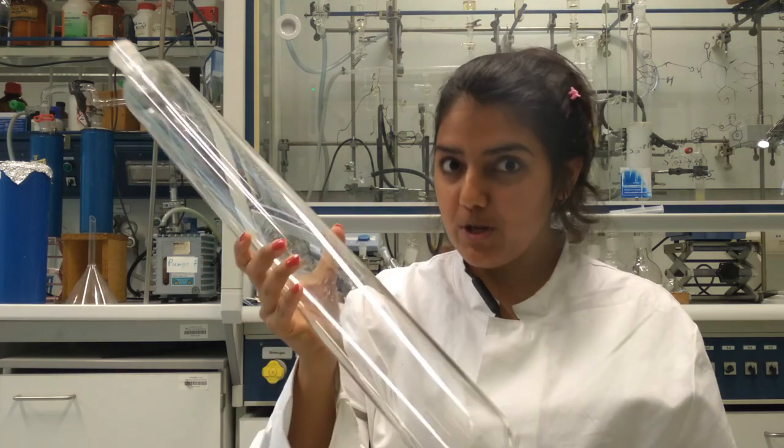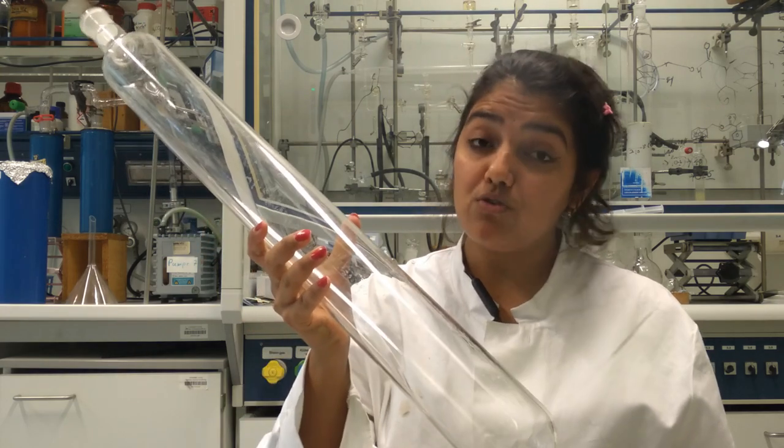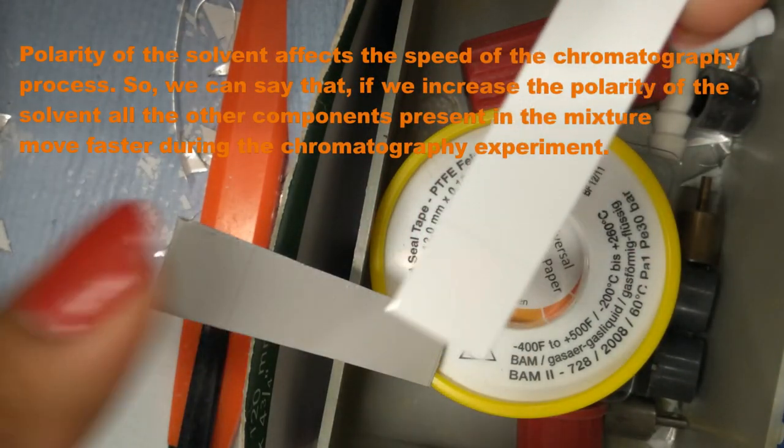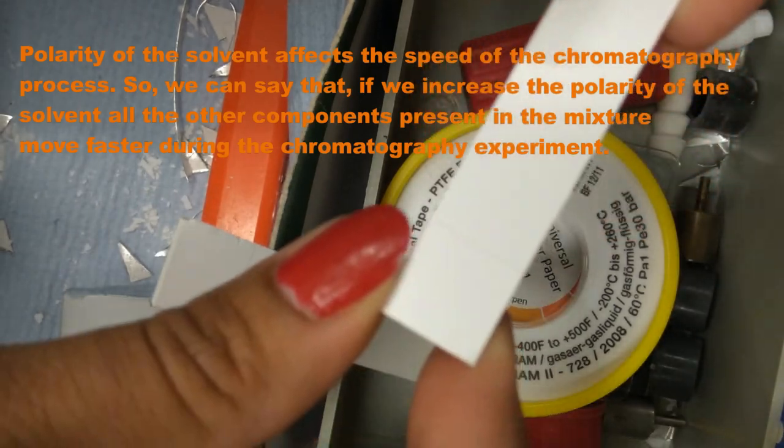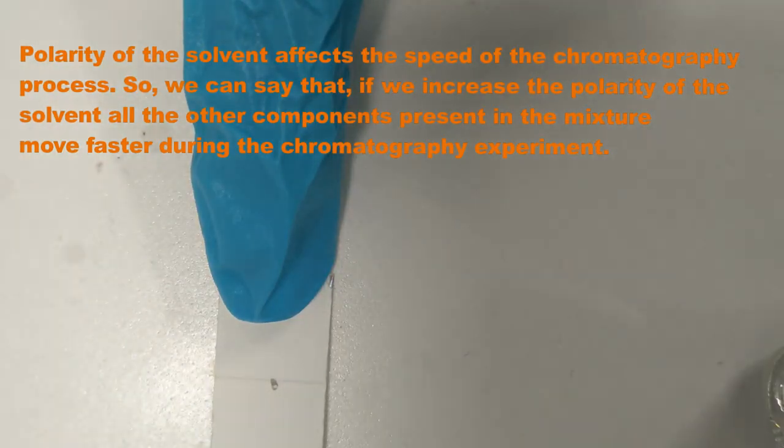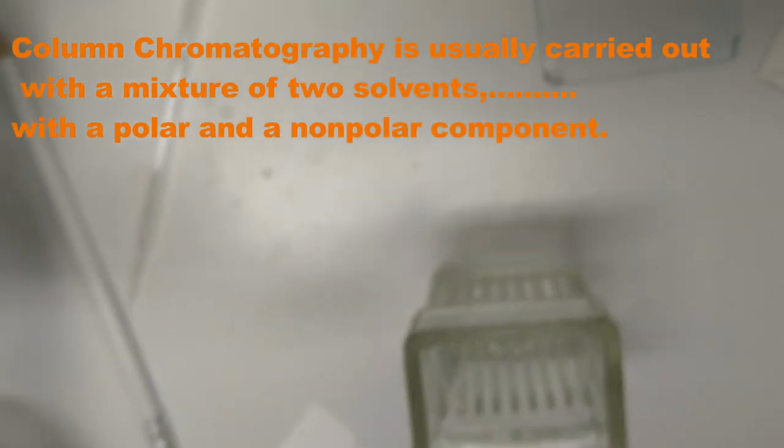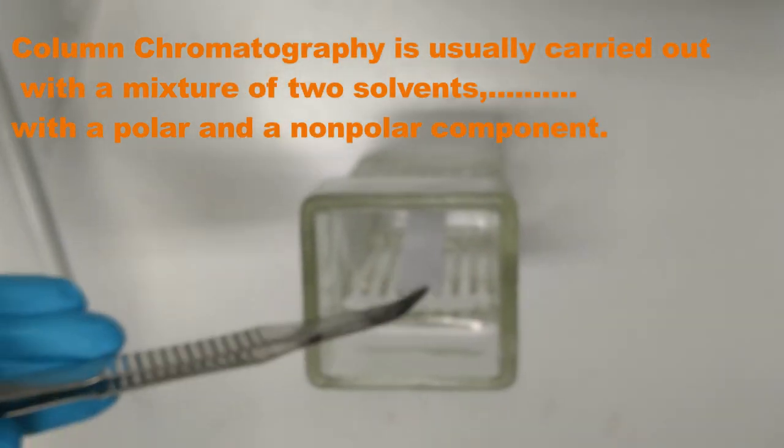All these depend upon the polarity difference and the amount of pure compound, of course. Because column chromatography is carried out with a mixture of two solvents with a polar and non-polar component. That's why we need to prepare TLC before starting column to get an idea about the solvent ratios which we are going to use further for column chromatography.